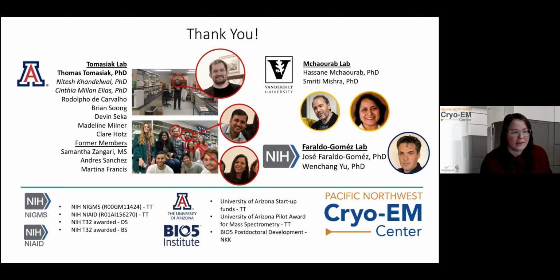Okay. So in the distribution of OF versus IF, do you think that the TMD1/2 could be in a dynamic motion, such as an NBD dimer and separates? They also wonder if you've seen any interesting movements from 3D VA or multi-body refinement. There's some other questions, but I'll let you finish with that.